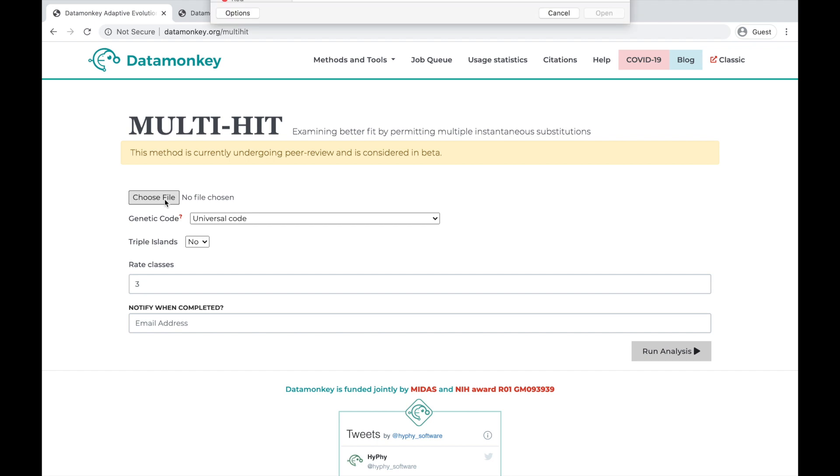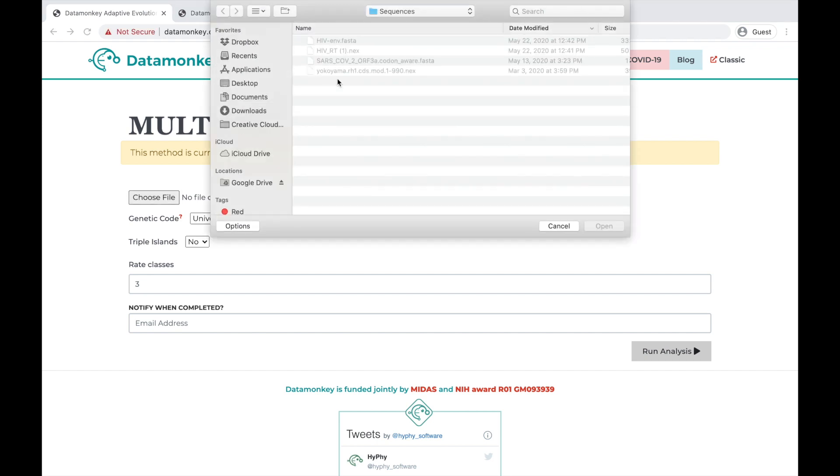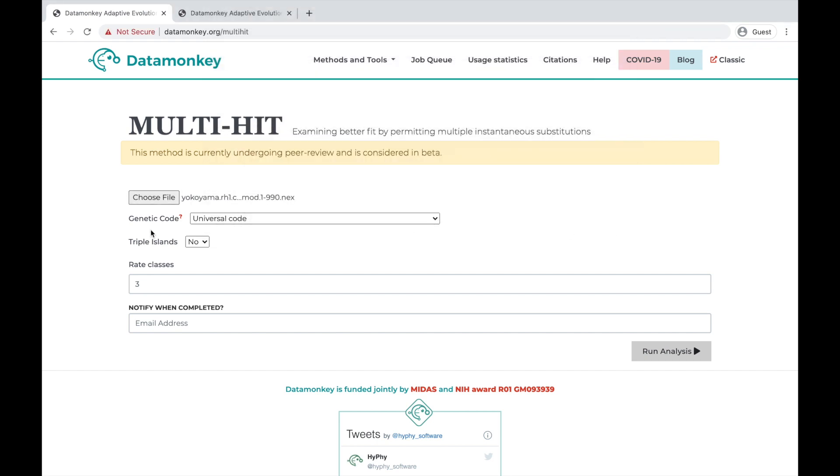Then, choose the alignment file you want to analyze. Make sure you have the right genetic code, and decide if you want to use a separate parameter for synonymous triple-hit substitutions.